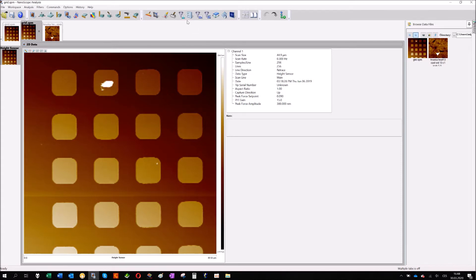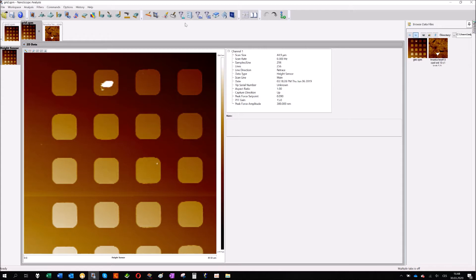I prepared for today two lessons about two tools: how to compensate the tilt of AFM image and how to measure the distance on AFM image. Before I start, I need to tell something with basics about the software itself. So let's start with that.